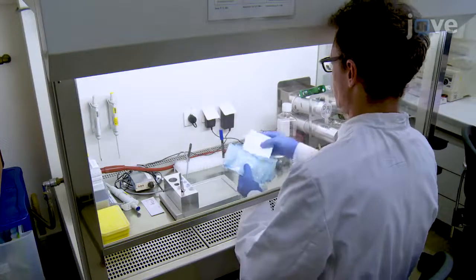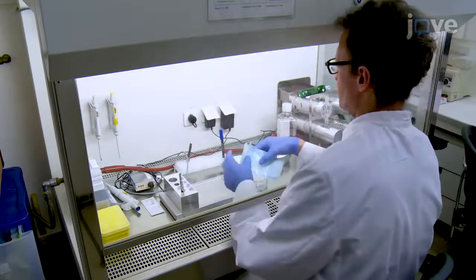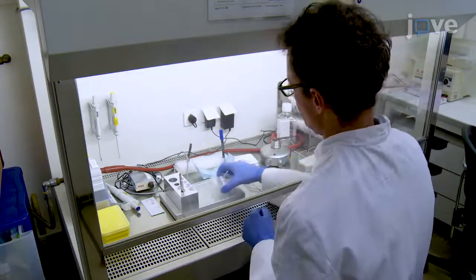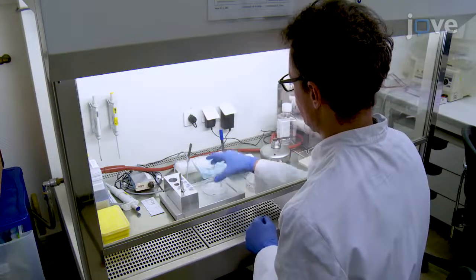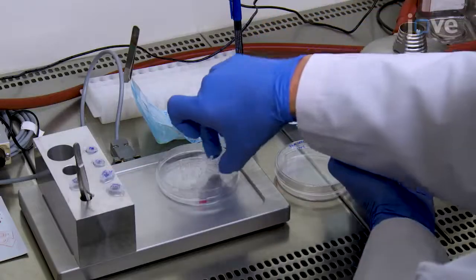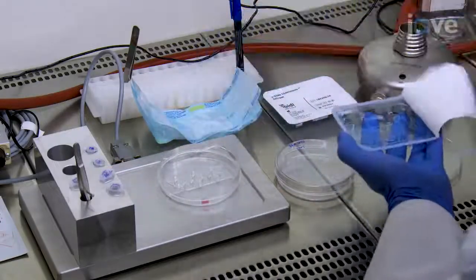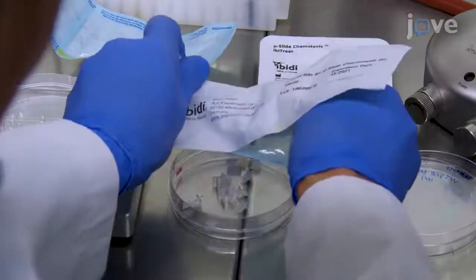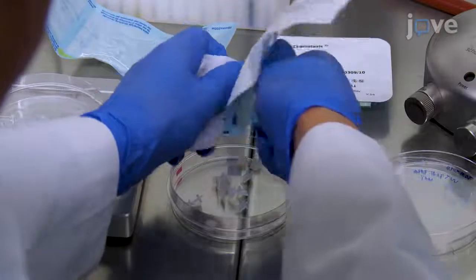Start by pre-filling the connecting channels of one or two chemotaxis slides with modified RPMI 1640 HEPES medium prepared according to manuscript directions. Place a slide into a cell culture dish and set the dish onto an aluminum block heated to 37 degrees Celsius.